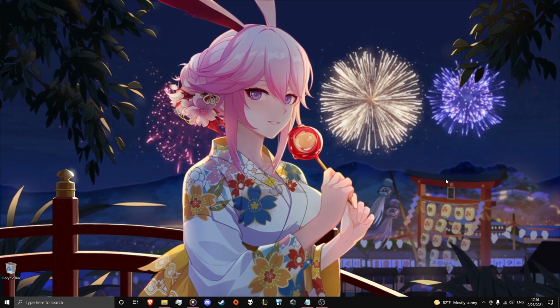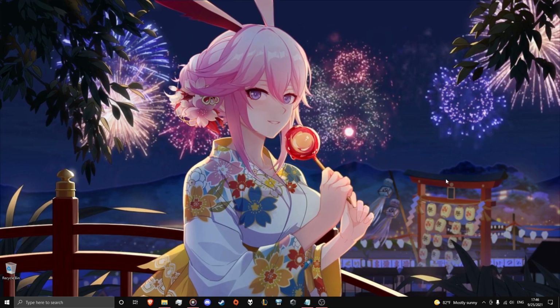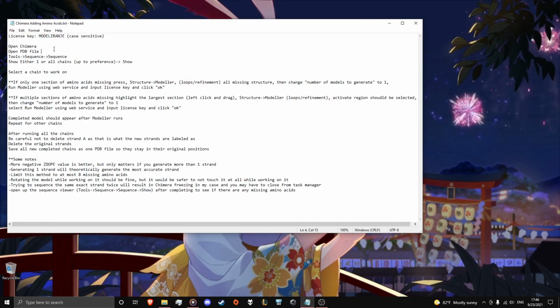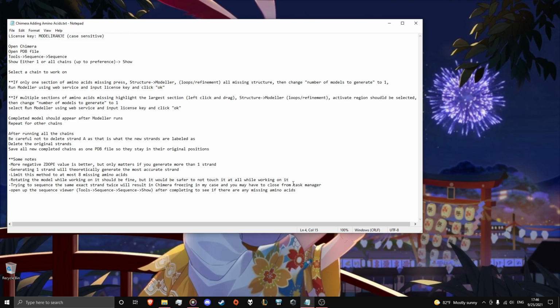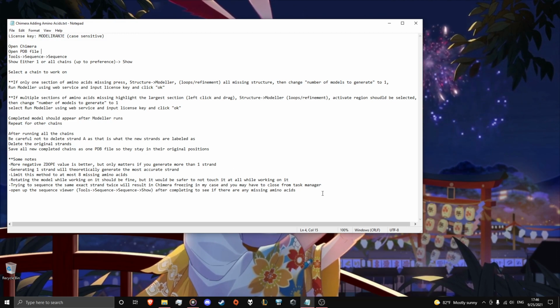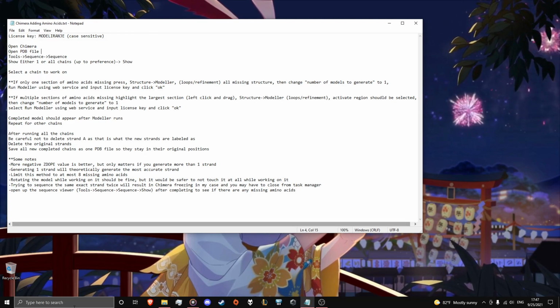This is a video on how to add missing amino acids to your strands in Chimera. I have a notepad on how to do this, and if you follow all these steps, you should be able to complete it. So you can just pause the video here and follow them if you want.